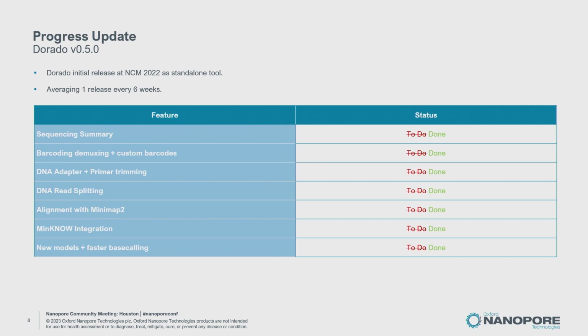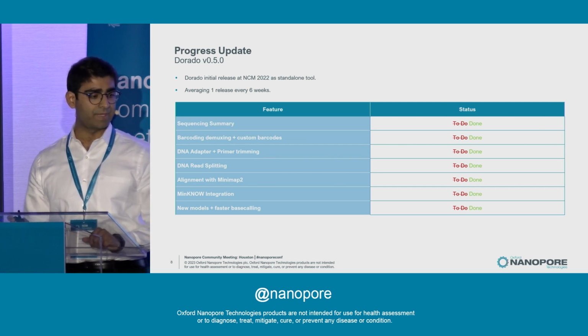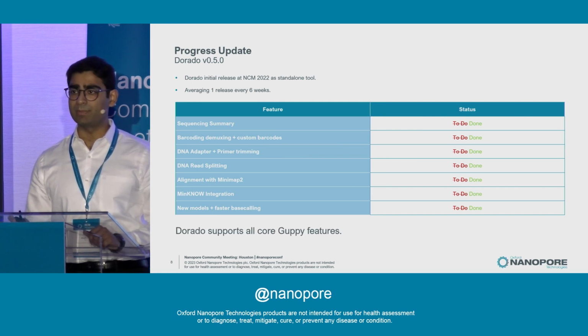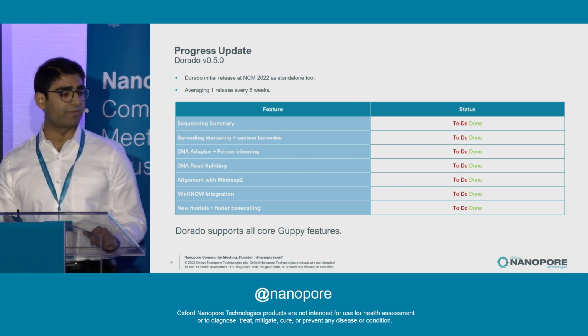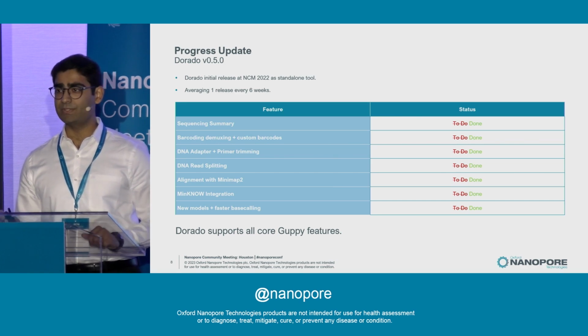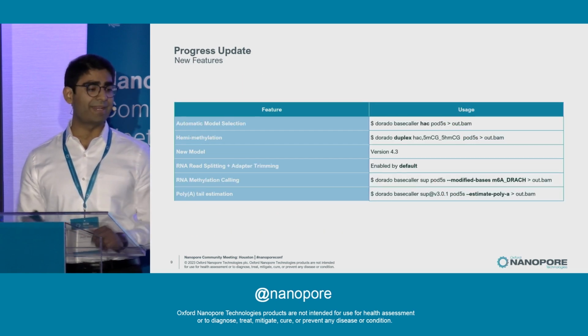We've also integrated Dorado into MinKNOW and made Dorado the default basecaller across all of our devices. And all of this has been happening in parallel with continuous improvements to basecalling speed and accuracy. So I'm happy to share that today, with this release, Dorado now implements all core features from Guppy. So if you're still using Guppy for any of your offline basecalling use cases, please switch over to Dorado. If you run into any issues, feel free to reach out to us, and we'd be happy to help you through them.